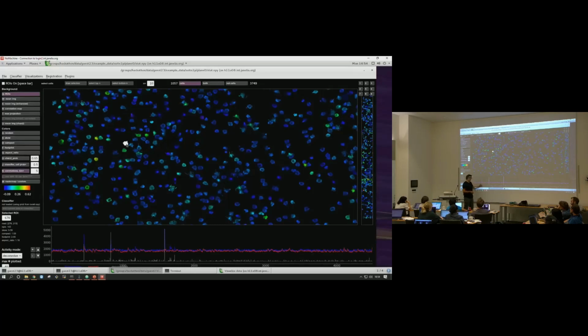So the magnitude matters, right? And roughly, to the extent that GCamp is linear, which it's not, but it's a first approximation, the magnitude should scale with the number of spikes. And that's the way you want to use it.